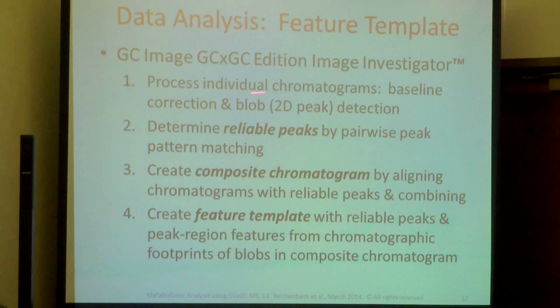Then we do peak detection, which in 2D we call these blobs, because they're not just single-dimension peaks, but peaks in 2D.